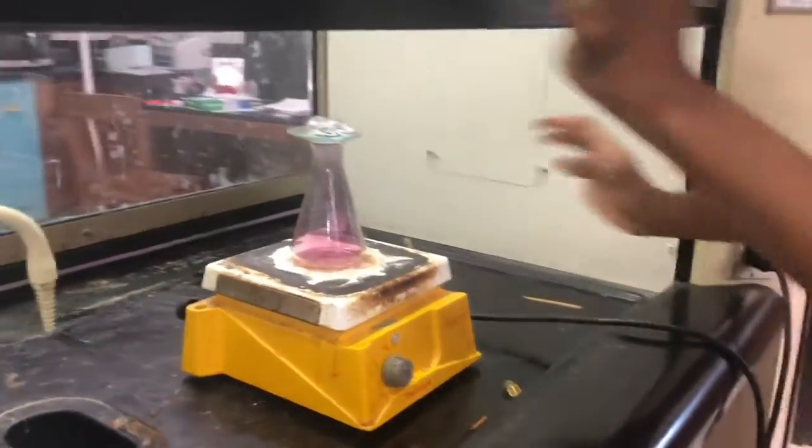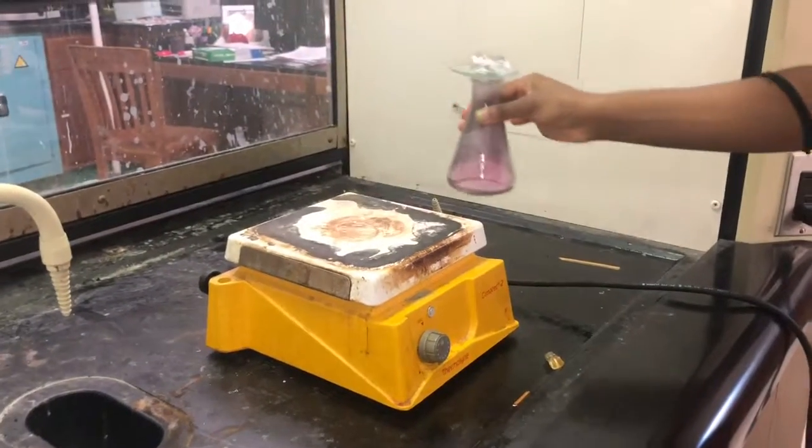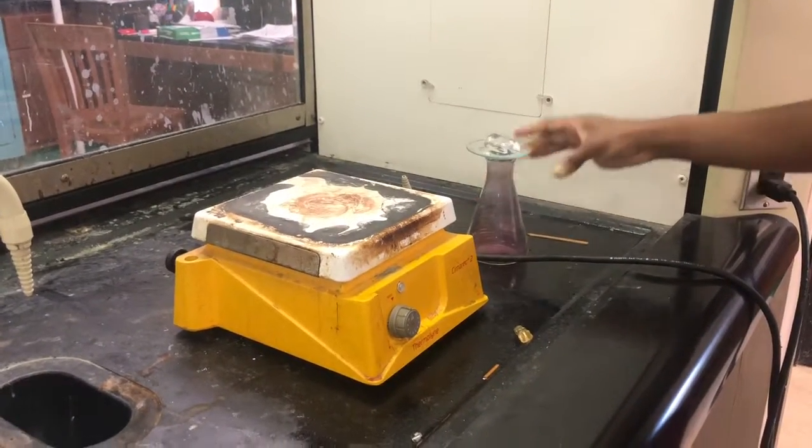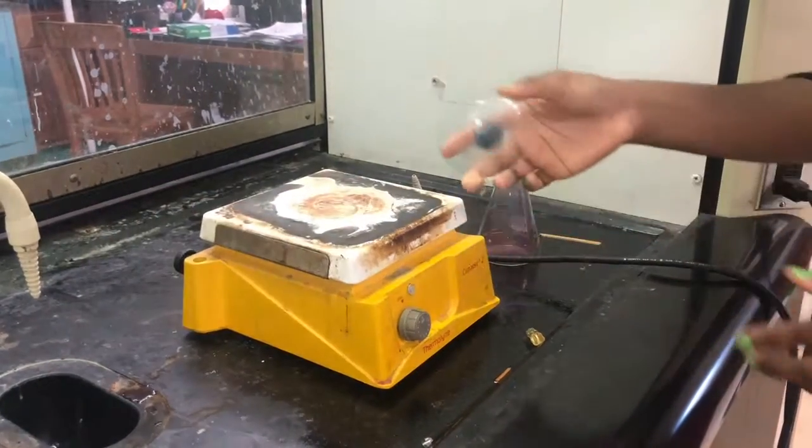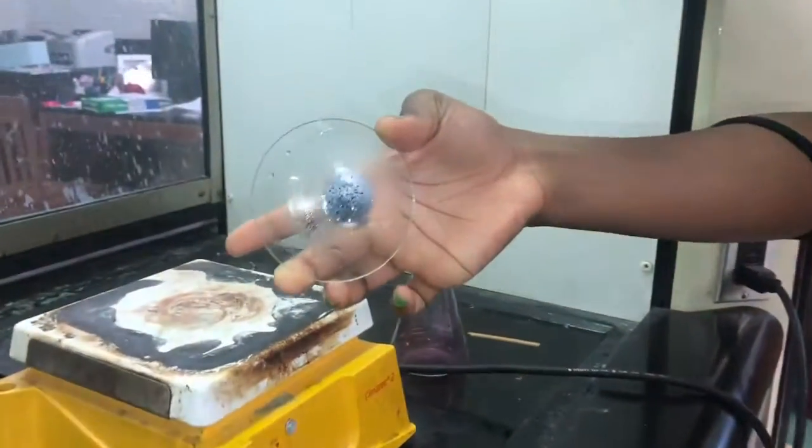After the iodine has turned into gas, turn off the hot plate and remove the flask, disposing of the melted ice on top of the watch glass. As you can see, when iodine in its gas state hits the cool surface of the watch glass, it turns into a solid crystallized form.